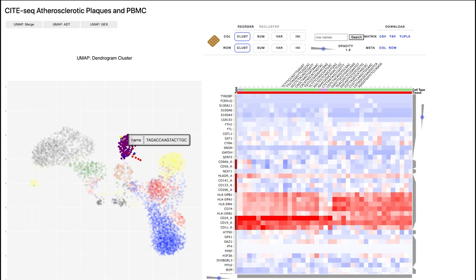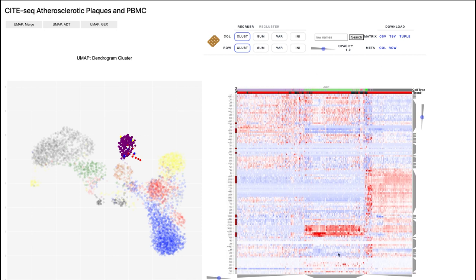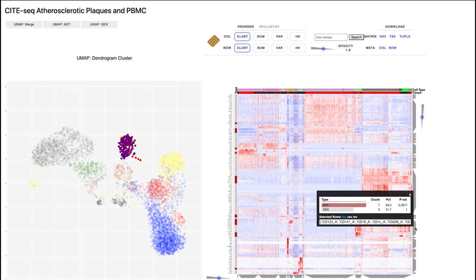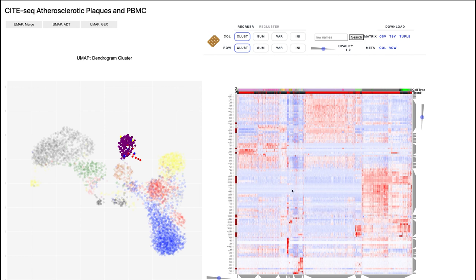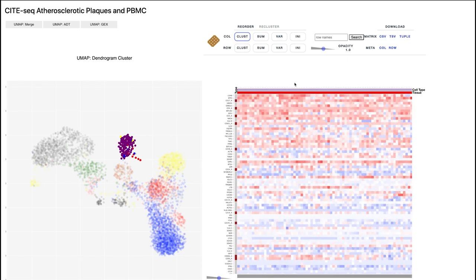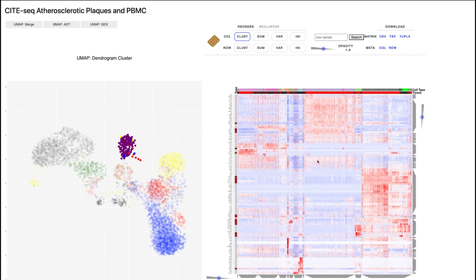We're showing that we're getting really good clustering in this dimensionally reduced space, and the heatmap is helping us understand the mechanism of that clustering — basically, they're high for these genes or low for these genes. We can click the row dendrogram here and select all the genes to take those genes to another tool for further data analysis. If we wanted to pick a different cell, we could double-click a cell and then reorder the expression of all genes based on that single cell, and start to identify different patterns in our data.